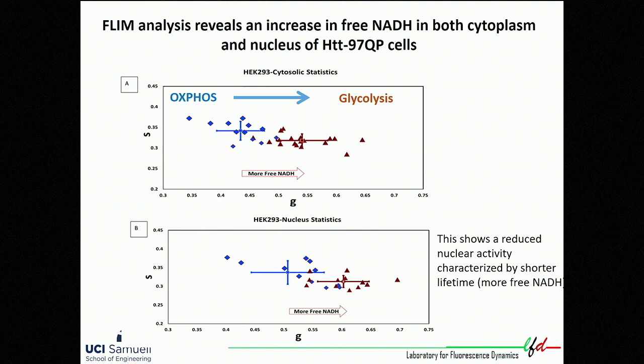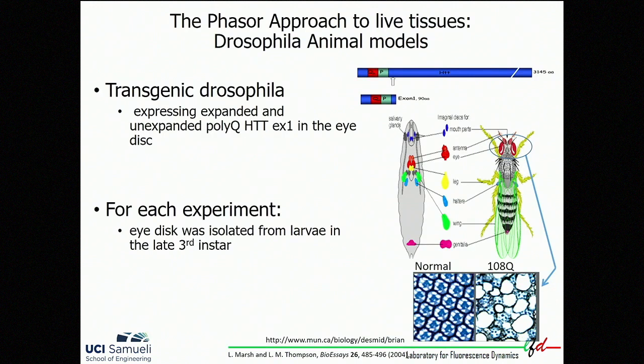And what is happening here is that it's already showing that the nuclear compartment has a reduced nuclear activity, characterized by this shorter lifetime. And I don't have time to go into how we know that. I'm very happy to describe that to you.